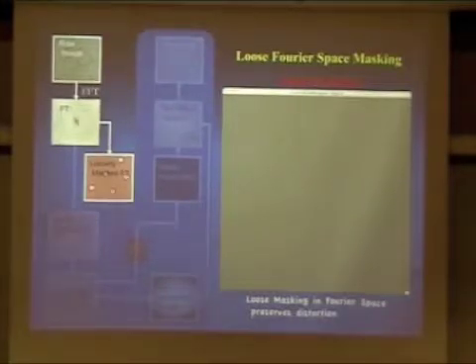So this is what I was able to show in the computing practical. I hope you can see the distortion on here. You see that in the back? Because we allow the distortion information to go through, you not only pick up what we had before in a very similar manner, but also the area that's especially bad.